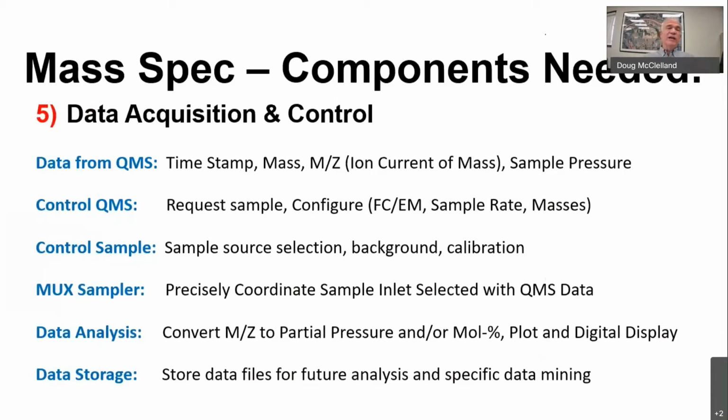It also has to simultaneously control that sample inlet and manage it. And the thing is, this needs to be a fully integrated system so that we know when we're sampling, from where we're sampling, and then marry the data with that. So it needs to be a seamless system, fully integrated.